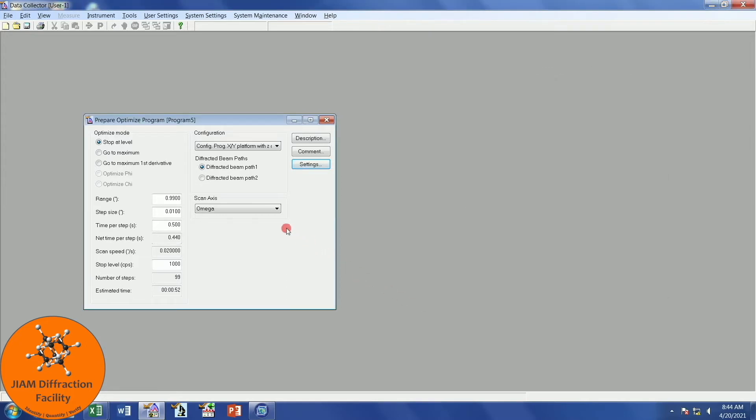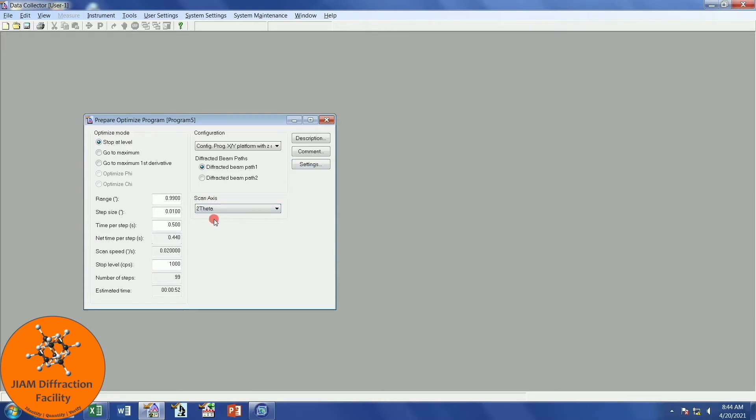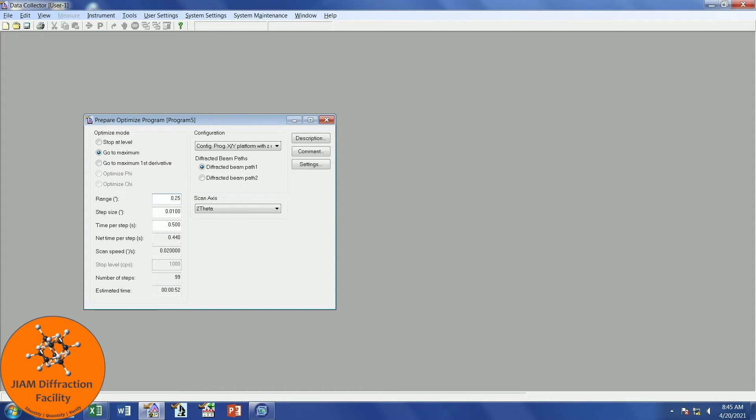The first axis that we will scan will be 2 theta. In order to optimize that, we want to choose Go to Maximum. What that means is that it will scan in 2 theta, it will find the maximum of whatever peak appears, and then it will change the 2 theta position of the detector to match up to the maximum intensity position. For 2 theta, I find the range of 0.25 to work well. Your step size should be 1/100th of the range, which would make this 0.0025. Time per step, I find 0.2 to work well. That gives us a 22 second experiment time.